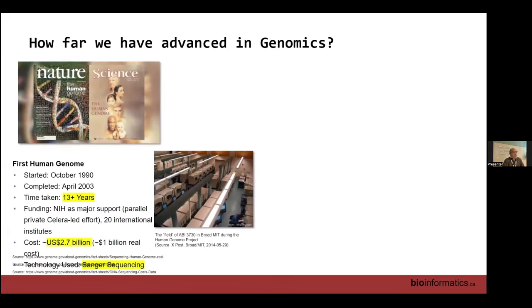All right. So I don't know if any of you were born after the first human genome. I was definitely born way before the first human genome was sequenced. In fact, and this was a surprising fact for myself, I was a plant biologist, and I was doing the parallel work of looking up how the plant genomes got sequenced. And the interesting thing is that at the same time, the human genome got sequenced. If you look at the page here, this is the first human genome publication in Nature and Science. It started in 1990 and was completed in April 2003. So you are very, very spot on. It did take almost 13 years to do that. It was NIH supported research with a lot of international institutes also joining forces.